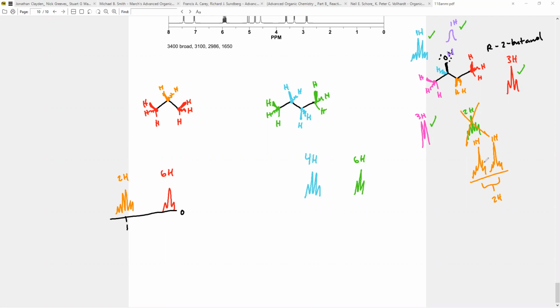these peaks are different. They have a different chemical shift. So despite being on the same carbon, these hydrogens are different from each other. And the separation is there, we can see that they're a bit different. If these hydrogens were the same, they'd have the same chemical shift. Theoretically, that's how it works. If 2 hydrogens have the same chemical shift, they should be identical. Usually that means that they're on the same carbon. But in this case, we see here that they're different from each other. So what possibly could be causing this difference?